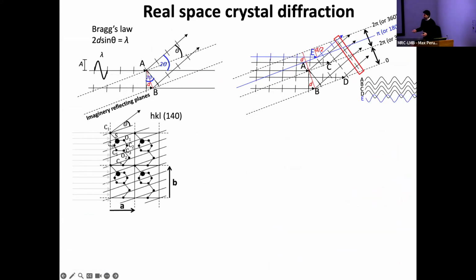So let's start to put some numbers, let's start to put some names. Let's say this is carbon 1, carbon 2, carbon 6, sulfur, oxygen. So how do we know what we're going to amplify inside the unit cell? All we need to do is the calculations for one unit cell. We know this is going to be amplified overall because the scattering in the phase of this atom is exactly the same as this, as this, as this. So let's just look at one unit cell. We can use an Argand diagram, which is not very important. It contains an imaginary and a real axis.